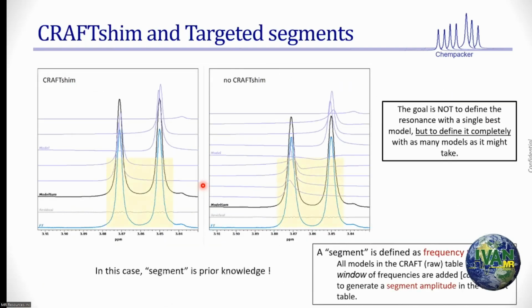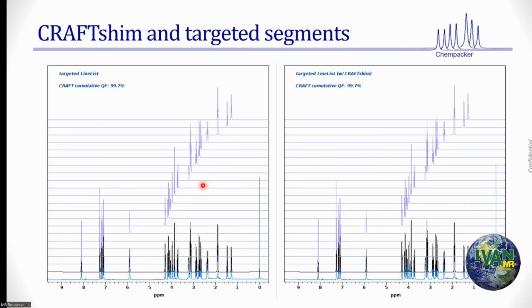Way out, almost done. If I go back to one of the early slides, I said, pick a peak. This is the peak I want. This is the peak I don't want. If I target the peaks of interest, in this case, this is strychnine. I know each proton as well as anyone can know. Or I just go on and pick up the paper by Gary Martin or Christina Thiel. I know all the chemical shifts, right?